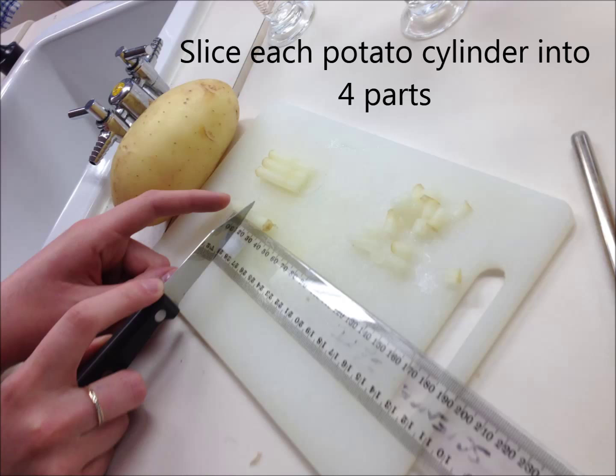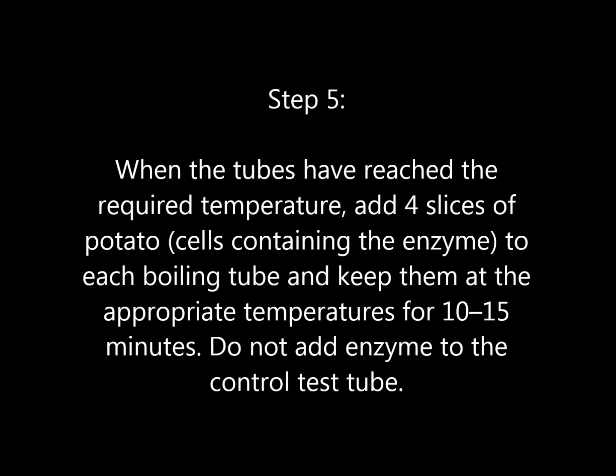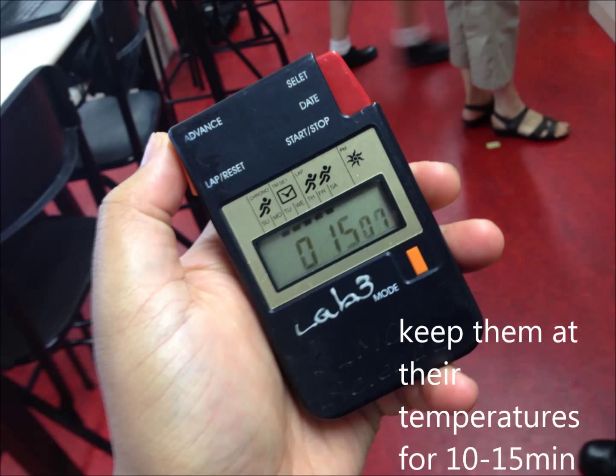Step 5. When the tubes have reached the required temperature, add four slices of potato to each boiling tube and keep them at the appropriate temperatures for 10 to 15 minutes. Do not add enzyme to the control test tube.